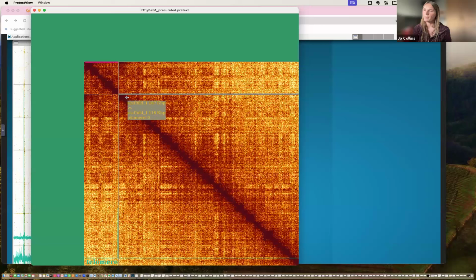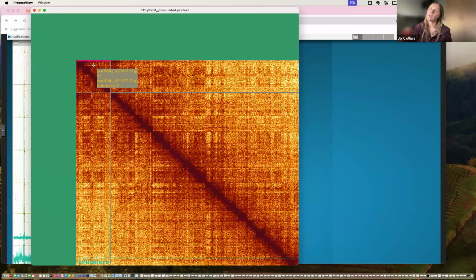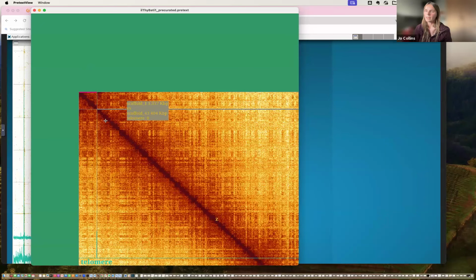These coloured bars at the top, I should have said before, are what we call scaffold identifiers, and they help us see very quickly if we're looking at one scaffold or parts of one scaffold or a separate scaffold. If you press I on your keyboard, you can very quickly toggle them on and off, which I find quite useful sometimes because it can cover a signal that I like to see clearly. So I've placed this, by HiC affinity, definitely at the right end of my chromosome.